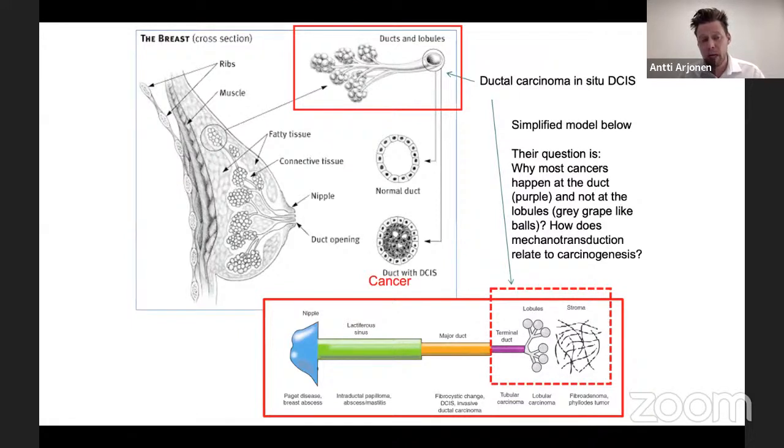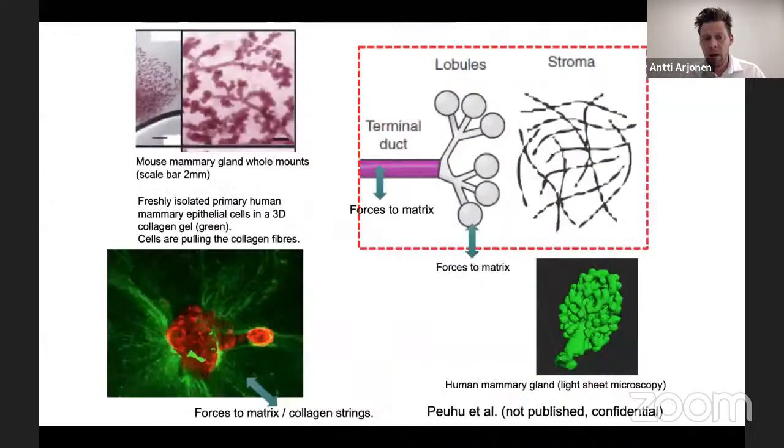By the stroma, I mean that we have this kind of tissue that has different kinds of structures inside of it. And the cells will always interact with the structure, they will always interact with the fibers, etc. So, for example, in this case, we have taken different kinds of imaging.